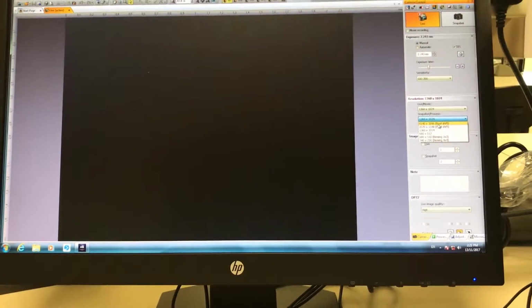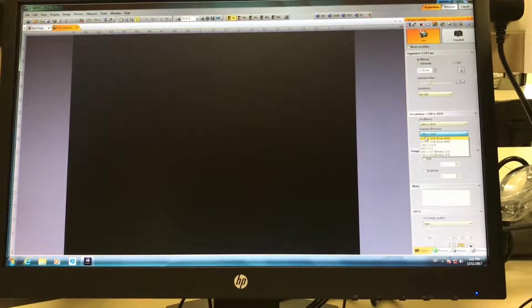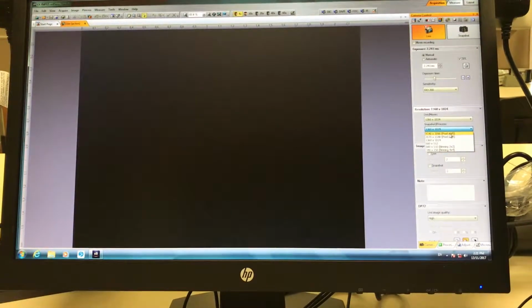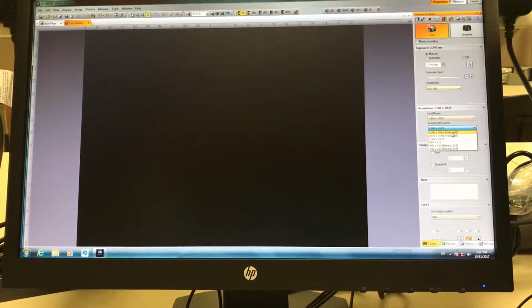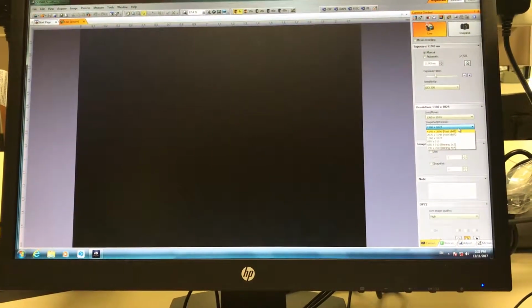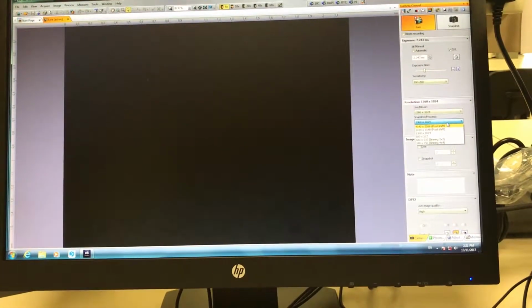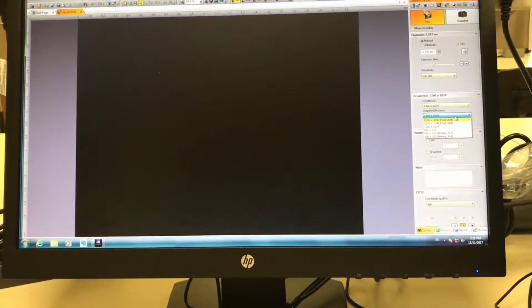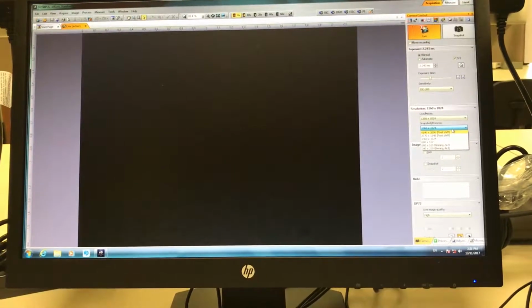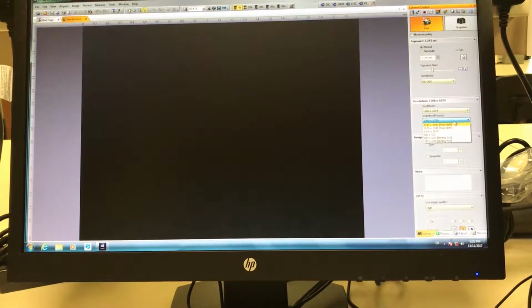Okay, so if you want to do high resolution imaging, you can consider using this high resolution imaging with this pixel shift mechanism. But this pixel shift mechanism will only be effective under low mag observation or low mag imaging. The reason is that under low mag, the digital resolution is the limiting factor of the whole image. When you go to high mag, like 20, 40, 60, the optical resolution is the one that limits the quality of the image itself.